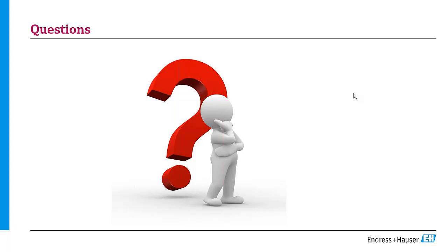As far as I'm aware, the bulbs for the CUS52Ds haven't changed since this product was launched. Sorry, Zoe, you couldn't hear me.